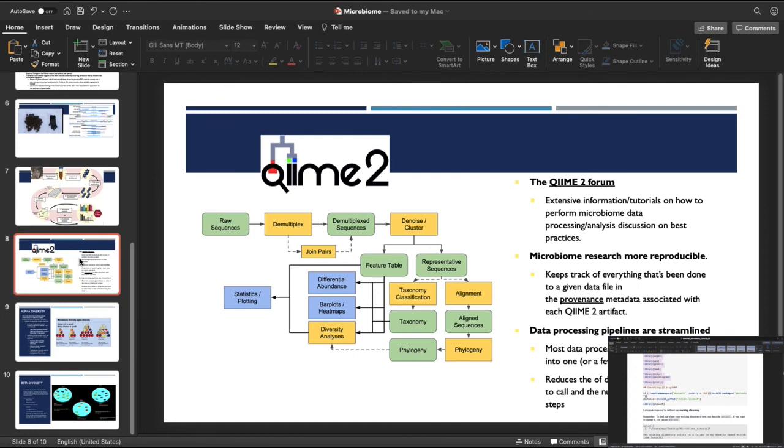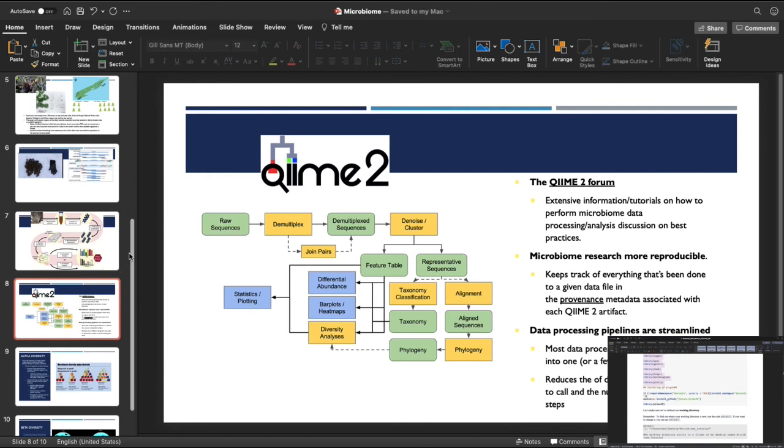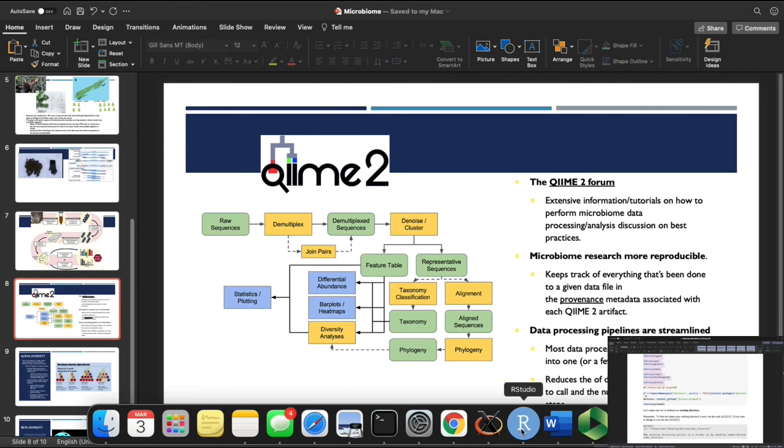It uses Conda, but it's specific for microbiome research, so the functions are specific for microbiome research. That's where I processed all this data, and then I exported it, and I'm using R to transform it, just because R is typically better for visuals. So that's why it ends in QZA.